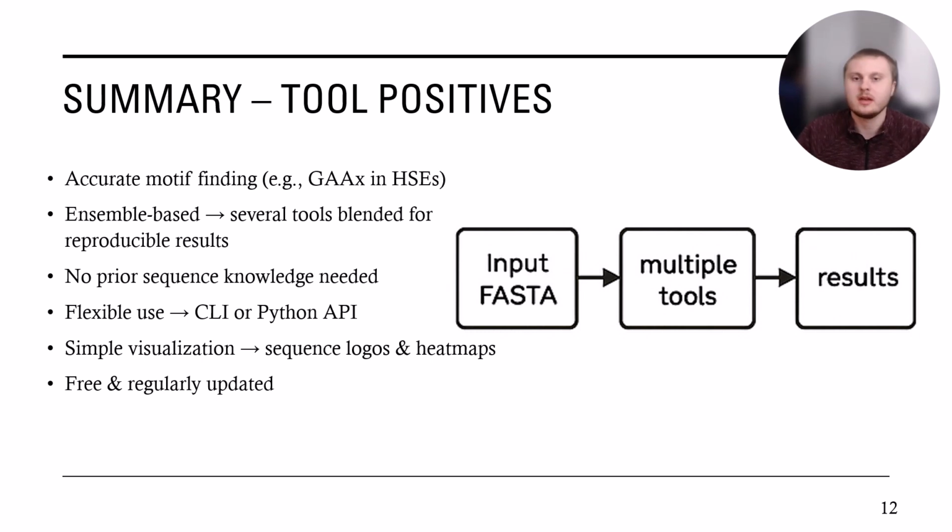For our case, it looks for the motifs in the DNA sequence. For us, it was GAA, and it looks for them and sees if the patterns match. For the logos, it did pretty good, the GAA, and we just had the fourth position being whatever it could be, but it was able to find them. And it can find these patterns without prior knowledge, which is very useful for a lot of different applications.